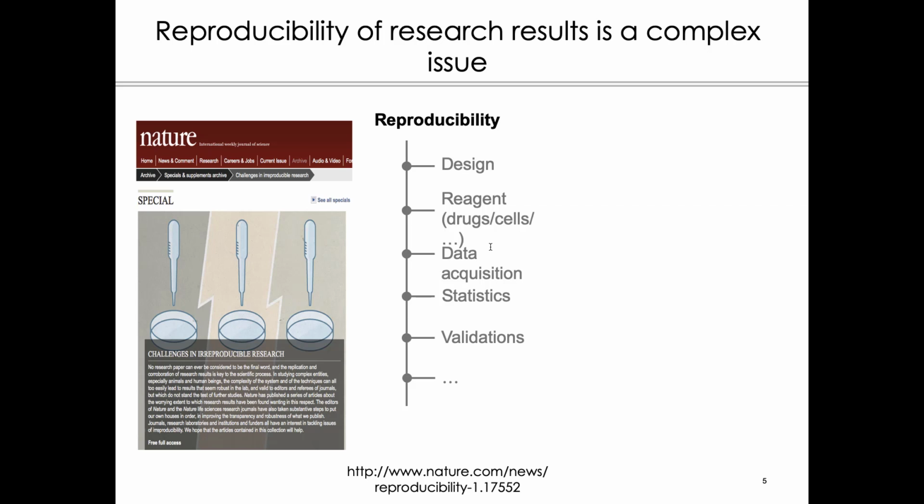So proper statistical procedures, and to some extent different modes of data acquisition, and I'll get back to that in the field of proteomics. This is just to say that they establish a kind of menu of topics with which we can break down the overall problem and start to investigate why we may have a problem, and where it could be resolved and where it could not be resolved.